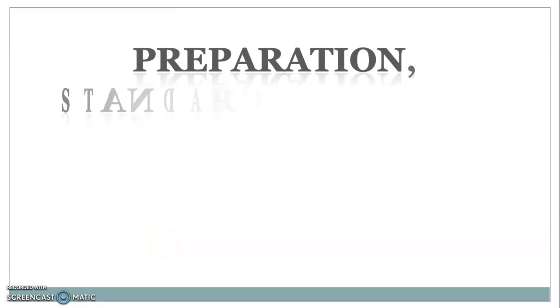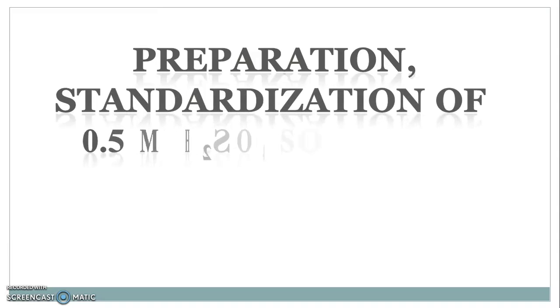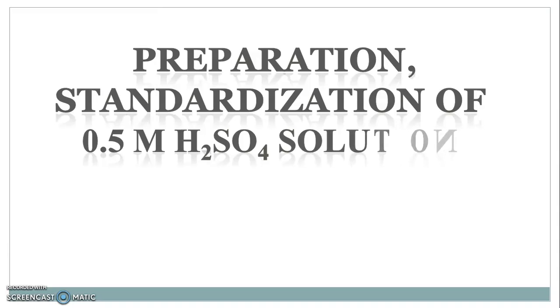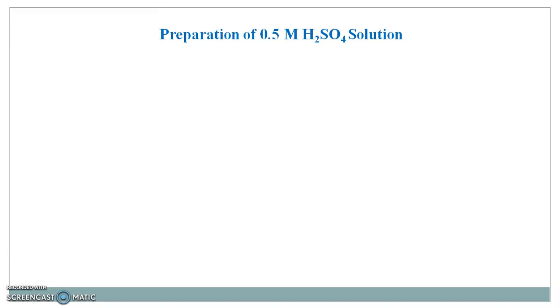In this video, we discuss the preparation and standardization of 0.5 molar sulfuric acid solution. This video contains the procedure for preparation as well as the basic principle involved in standardization of 0.5 molar sulfuric acid solution. Let's begin with the first part, preparation of 0.5 molar sulfuric acid solution.